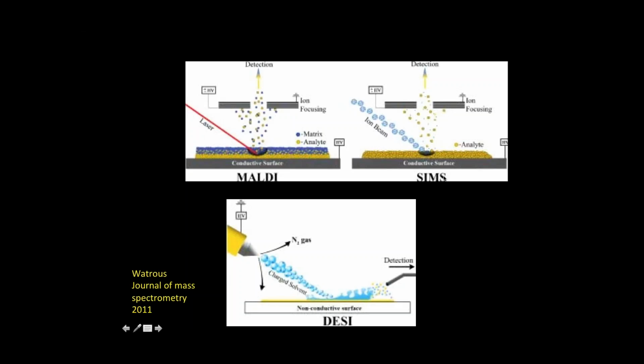There's secondary ion mass spectrometry. One way this works is that you hit the sample with buckyballs. You have your analyte, and you accelerate the ions into the gas phase. This is a matrix-free application, and there's some really nice biology that has come out of it. The other approaches are DESI or nano-DESI, and the way DESI works is essentially you have a solvent flow that hits your sample, and it bounces up molecules or droplets into the air, and then you basically capture those droplets with the mass spectrometer, and you can raster over a sample and get this kind of information.